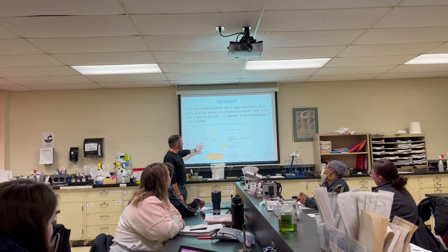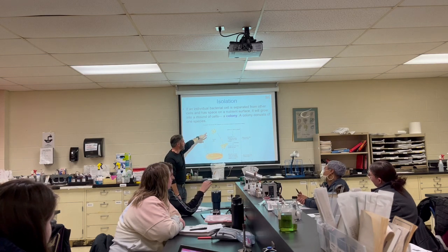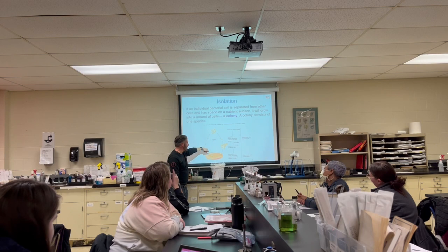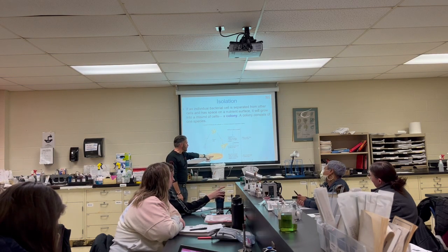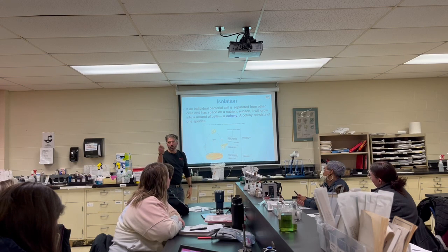Where am I? All right, so here, just showing you the parent cell. These are other cells. We're going to streak them out. We're going to separate them, and then these singular bacteria should grow into these colonies. And I'll draw it up on the board later.